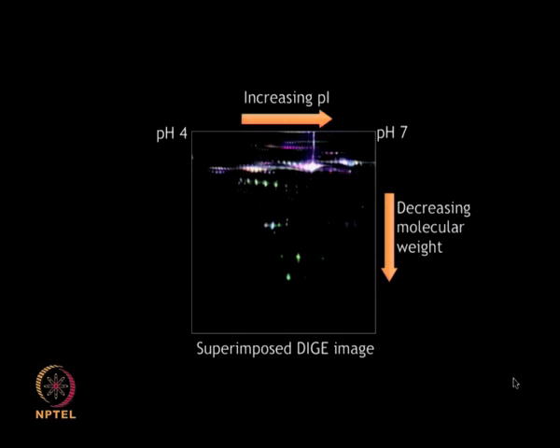But most importantly, by looking at the gel pattern, if you are doing abundance proteomics, comparing the expression of two samples, different protein expression can be immediately observed on the gel with the red and green patterns. If there is no change, it will appear as white.